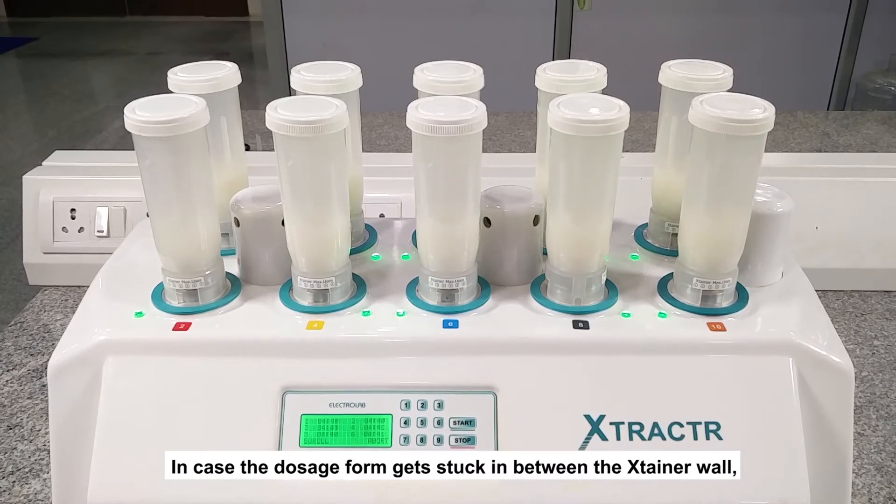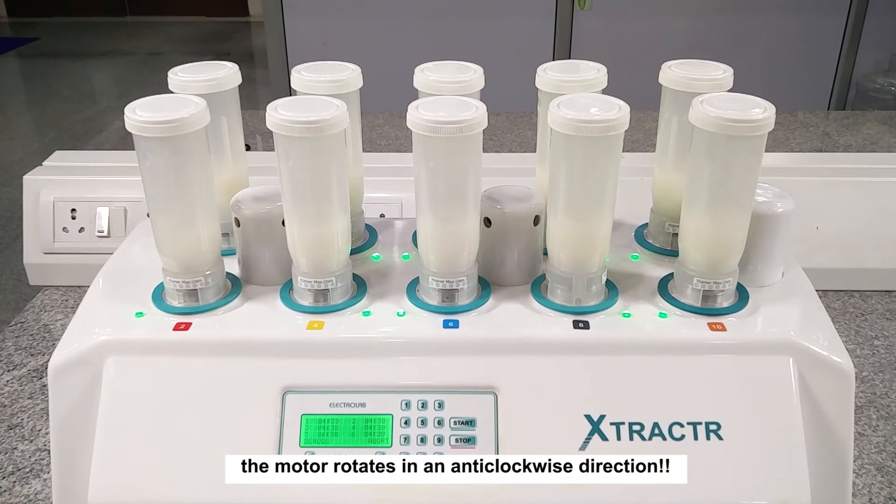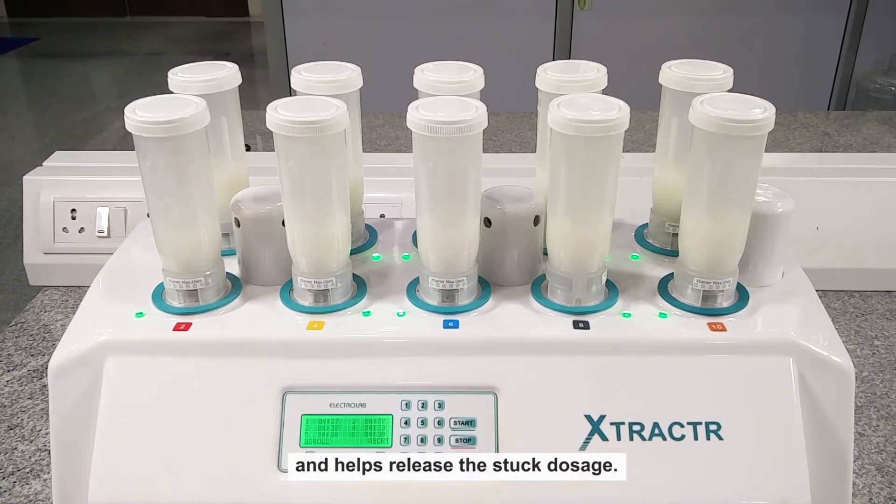In case the dosage form gets stuck between the Extainer wall and the blade, the motor rotates in an anti-clockwise direction and helps release the stuck dosage.